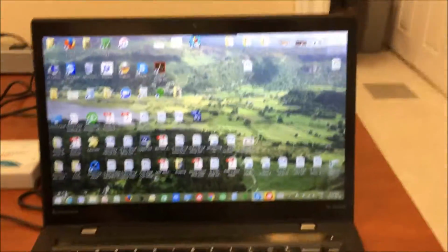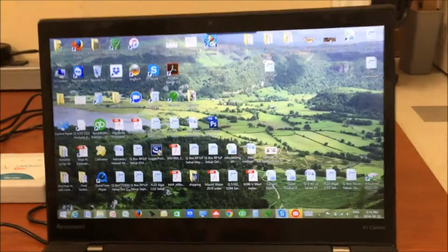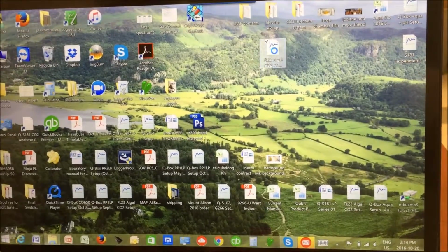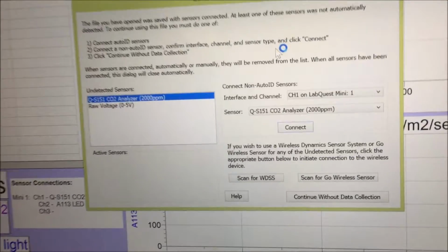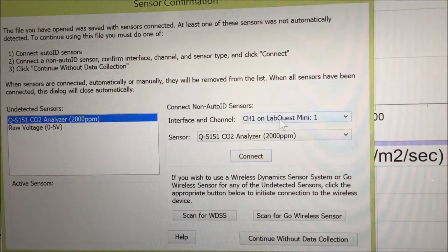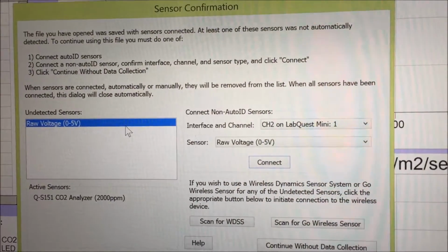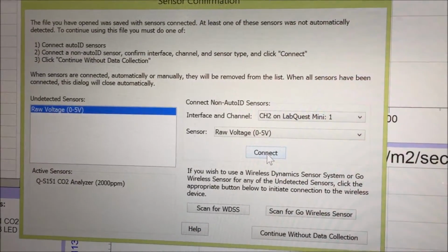The LabQuest Mini should be plugged into the computer before you open your experimental file, the FL23 Algal CO2 setup. You open the file. The first thing you have to do is connect your sensors. We have the CO2 analyzer, you connect it to channel 1 on LabQuest Mini. Say connect. The second sensor is raw voltage here, that is our LED light source. It's connected on channel 2.